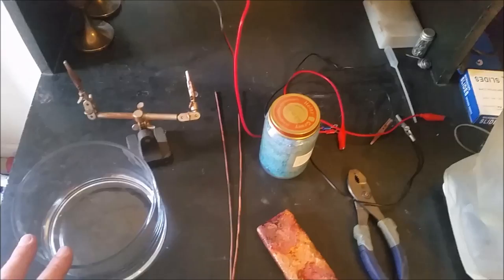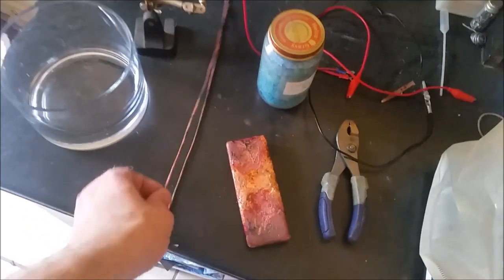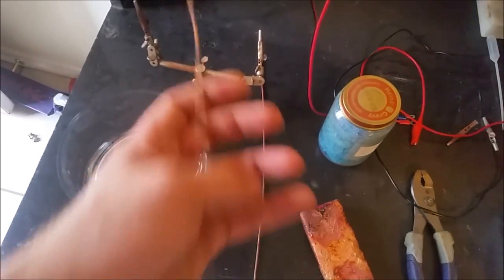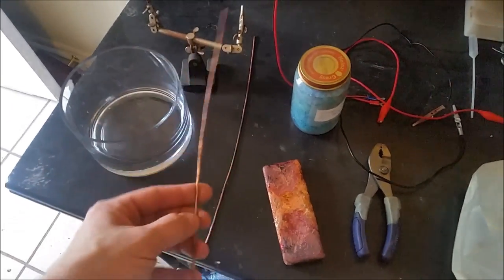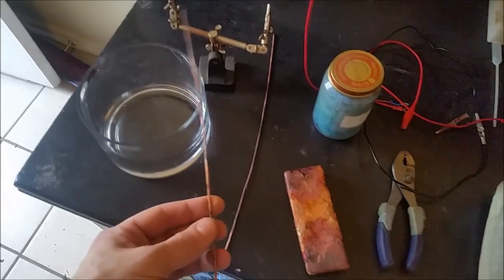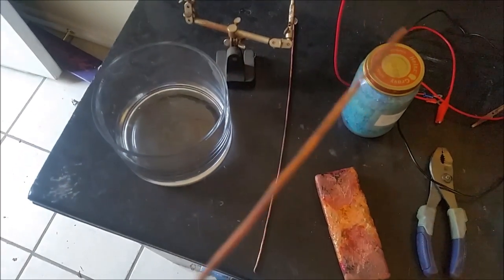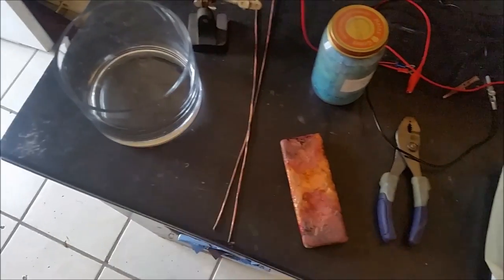Hey guys, so today I'm going to show you how I make really large copper crystals. Essentially, I use a small piece of wire — this is a little thicker wire — but this will be the cathode. This is going to be what the crystals grow on. It's quite dirty, as you can see, but we're going to take some sandpaper to that and clean it up before we use it.